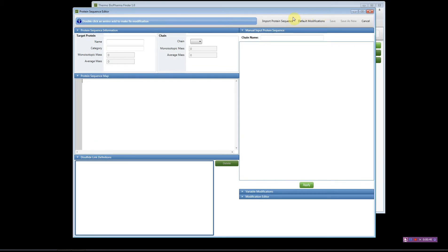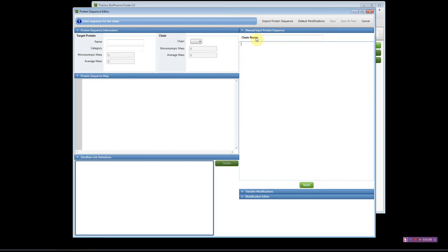The first step will be to import your protein sequence from a FASTA file, or you can enter the protein sequence manually using the manual input protein sequence area. Here you can type amino acid residues in the space provided, push the Apply button, and name the chain or the protein.